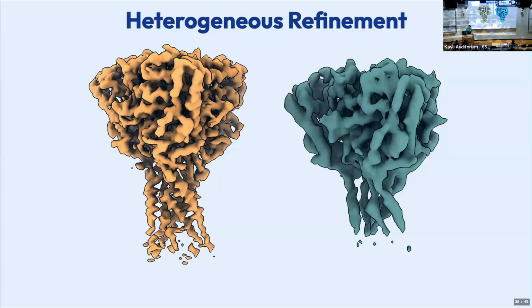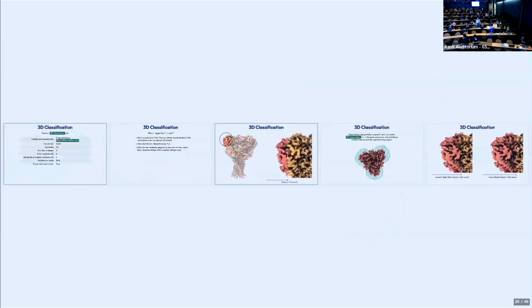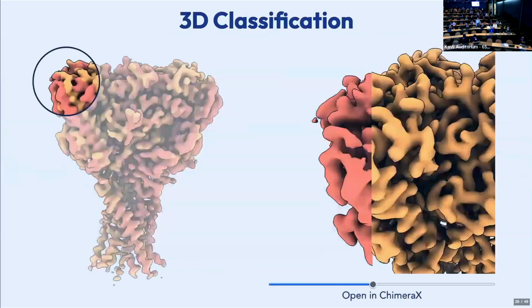Just one question. Before you did the first 3D classification with C1, the consensus before that was also from non-uniform, right? That was done with C3 or C1? That was done with C3, yes. The initial consensus refinement I did with C3. And even after the C3, you can still do a 3D classification with C1?